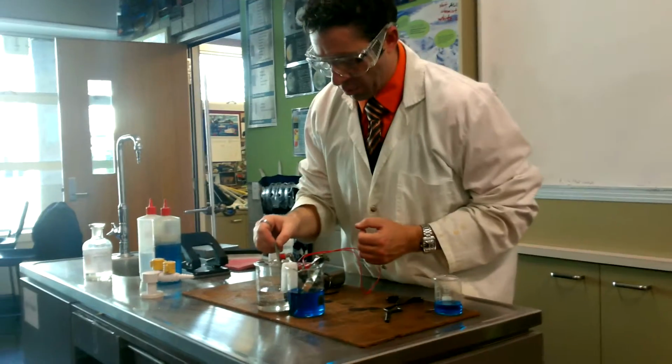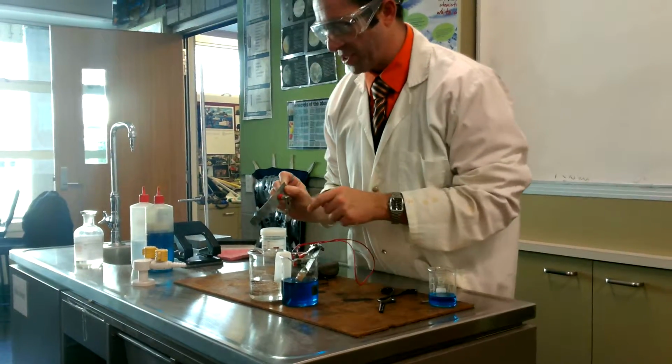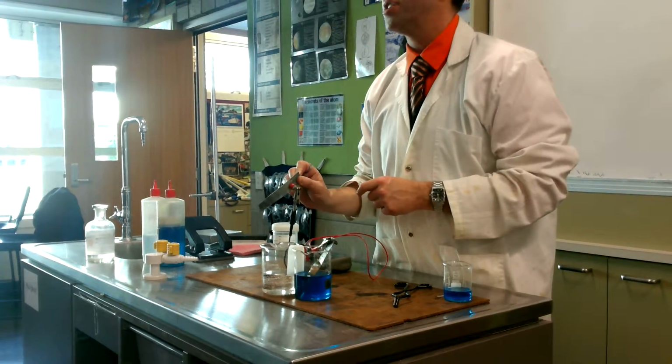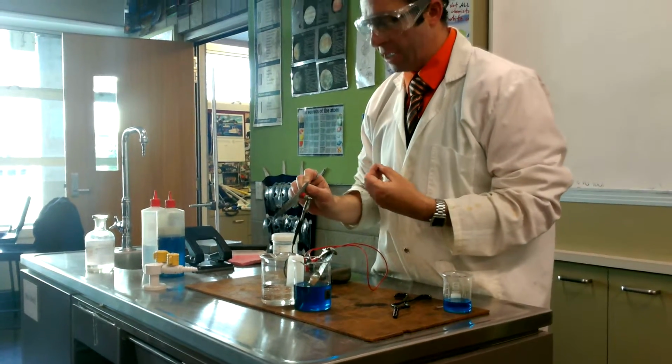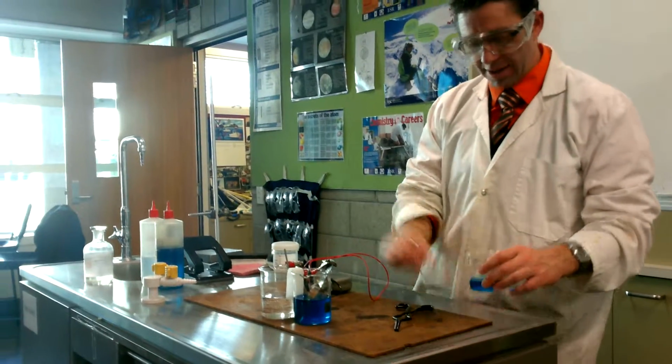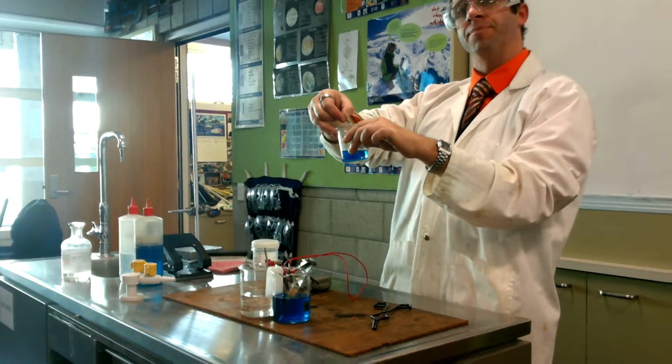And eventually we'll see that, and you can probably see it quite clearly there, the bit of zinc gets very, very thin at the bottom. So we know that it's being eaten away or corroded. So this must be the oxidation reaction, just like the zinc being oxidized in here.